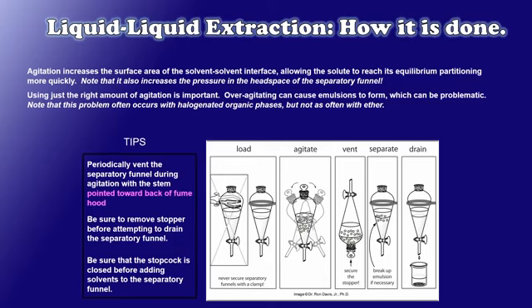The first thing I want to point out here is that we never clamp one of these devices using 2 or 3 fingered clamps. They're simply not stable enough. Instead, we use a metal ring clamped to the rail that's just a little bit narrower than the top of the flask. So when it's inserted and lowered downward, it eventually stops and is held in place by that ring.